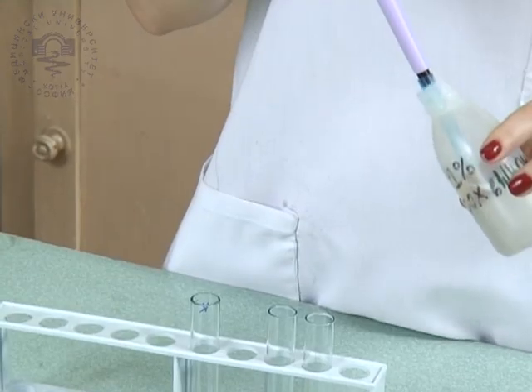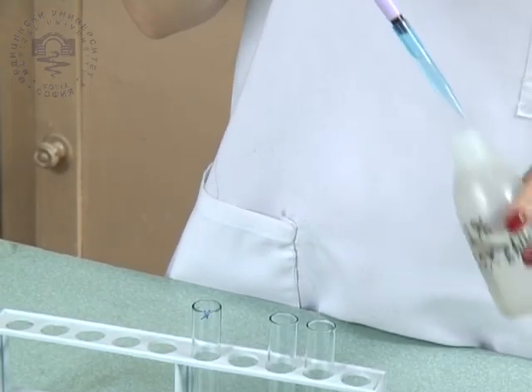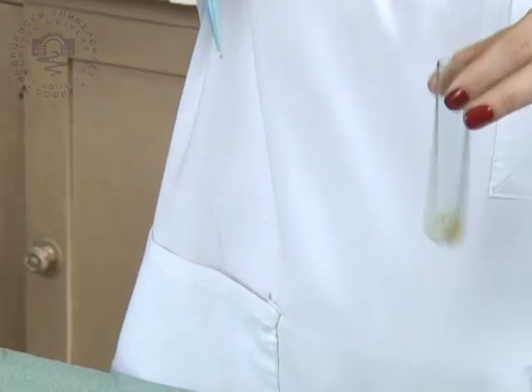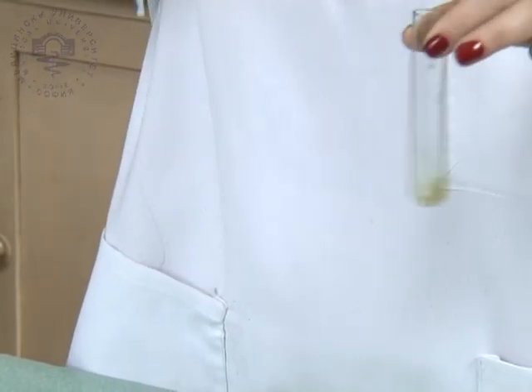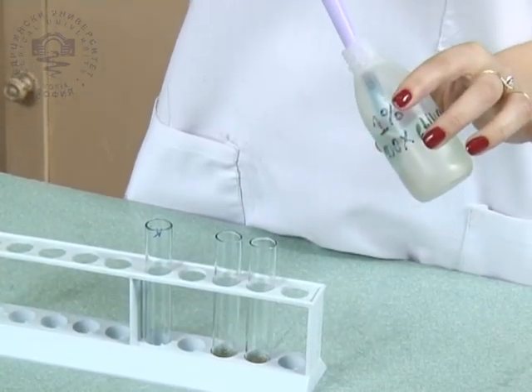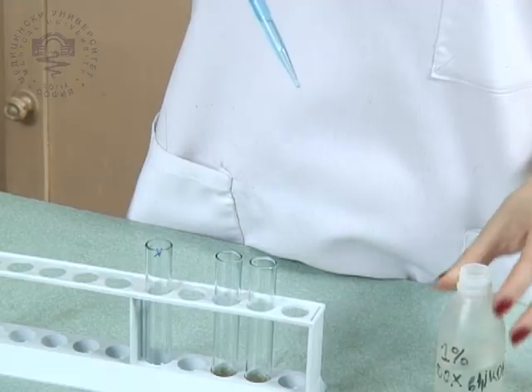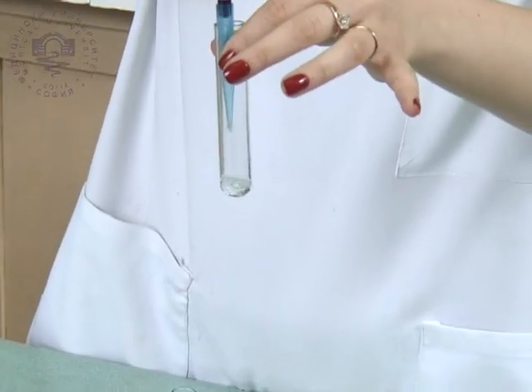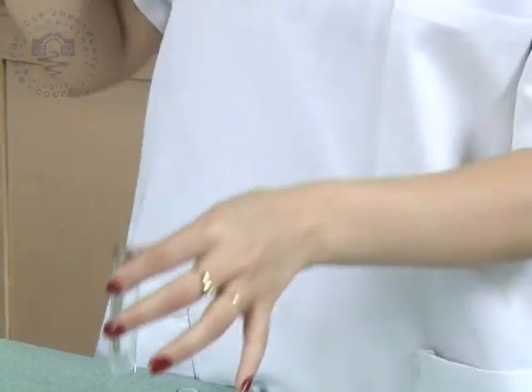The deoxycholic acid lyses the mitochondrial membrane, and the proteins pass into the solution, which becomes clear. This allows using a single-beam spectrophotometer in the visible part of the spectrum. Lysing with detergent is not necessary if using a double-beam spectrophotometer, where the control test tube contains the same amount of mitochondrial suspension.